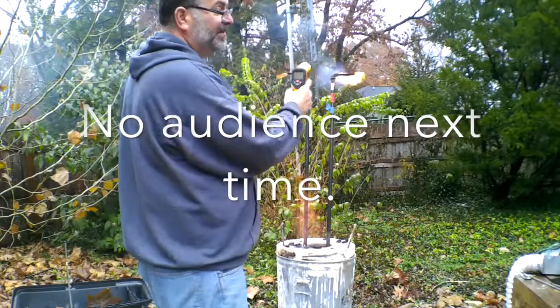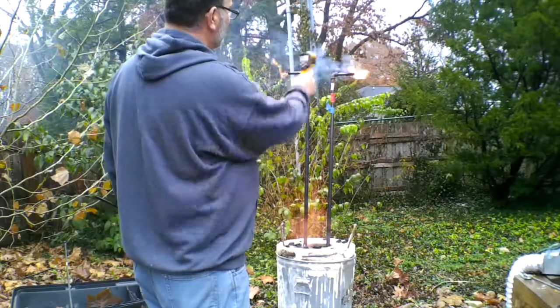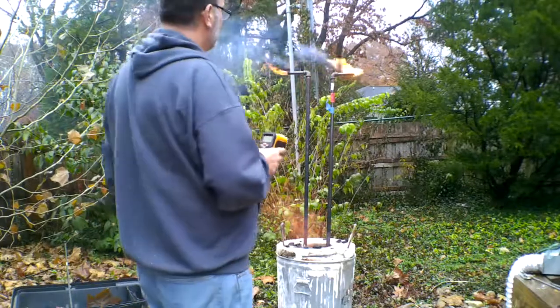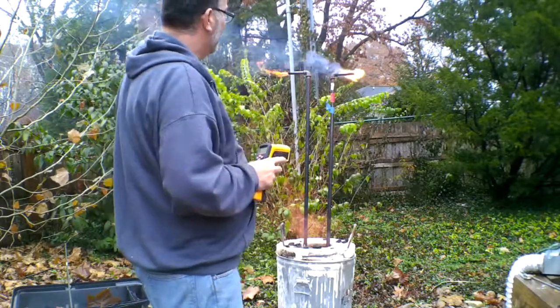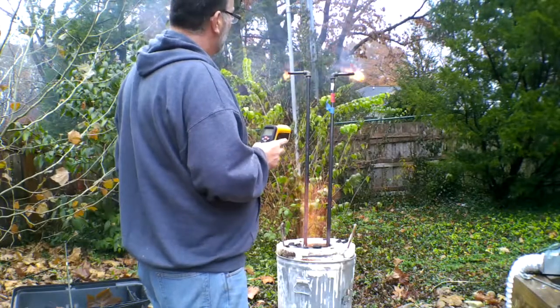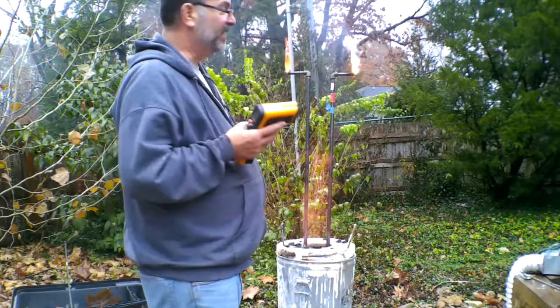The gas is forcing. Look, there's a little spout of carbon. See that? Yeah. That's because of the force of the gas pushing the carbon up the tube. Yep, that's too bad. I'm losing reaction products, which makes it really annoying.